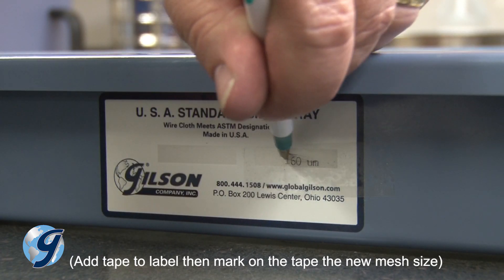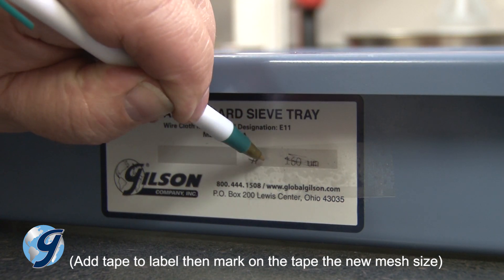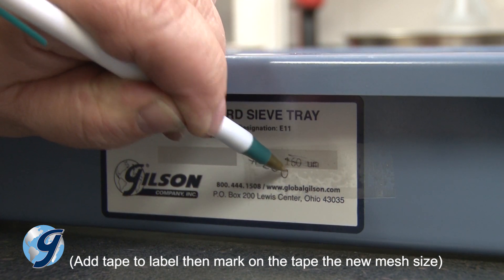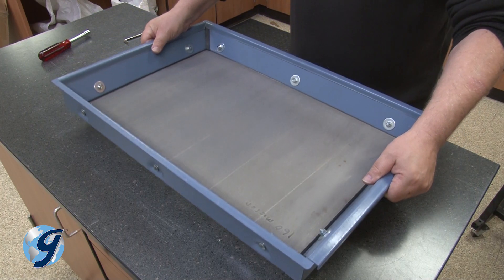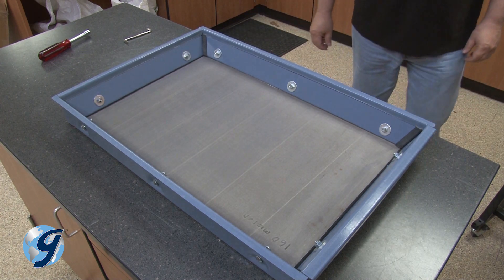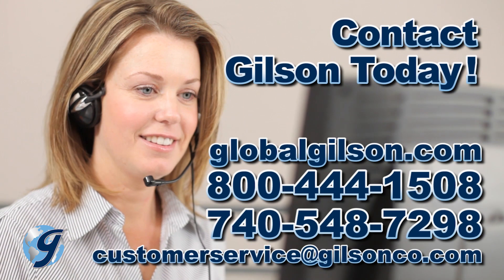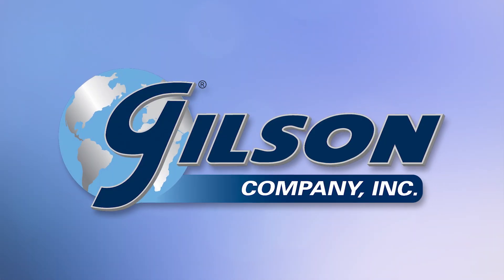If you are exchanging wire cloth to a different size mesh opening, be sure to mark the screen tray with the correct size opening. Examine your screen tray mesh frequently, and for any questions concerning your Gilson testing screen or for any Gilson product, please contact your Gilson technical support team.